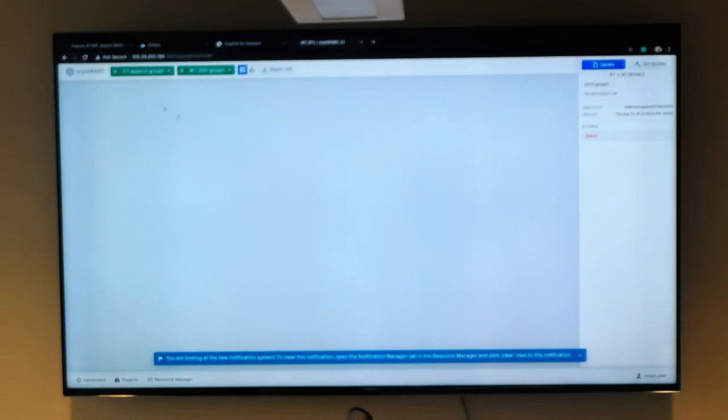So to orient you, ideally you go into your particular group and create your own particular workspace. This is going to help us because everyone's going to start submitting jobs. They may or may not run into trouble, but that'll allow me to understand which group is having trouble and how far each group has gotten.